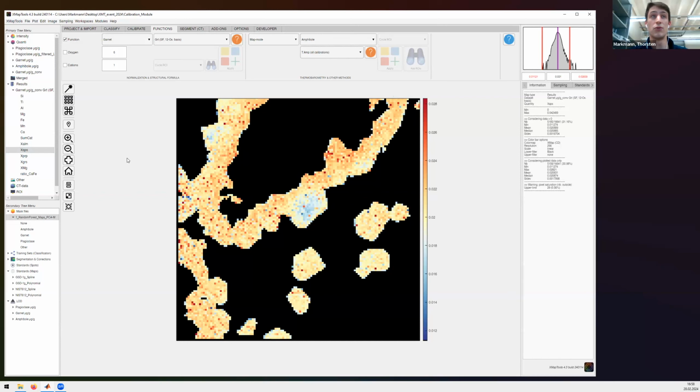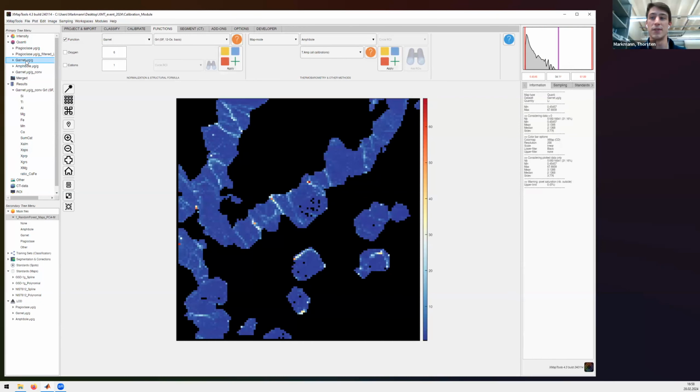And this you can do for the predefined mineral phases. Step two is now the spider module. And this is very important because we are measuring trace elements and we want to interpret them. So what we do, we select again the garnet we have been measuring. And we can use this garnet and the module section in the top here to say spider module.